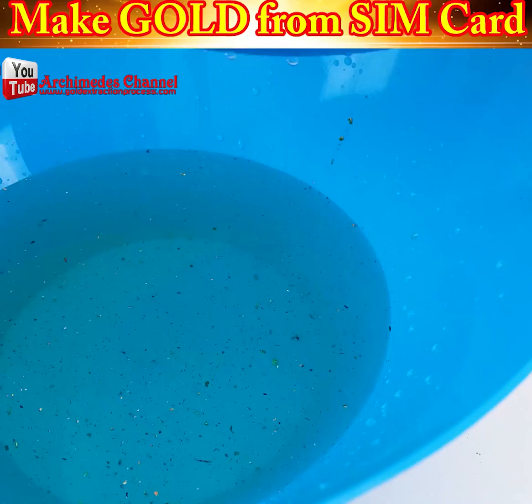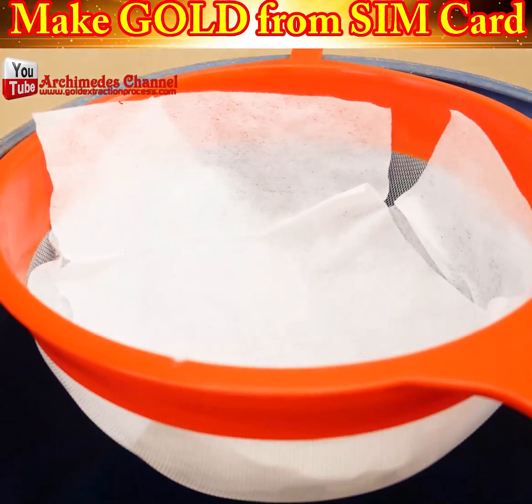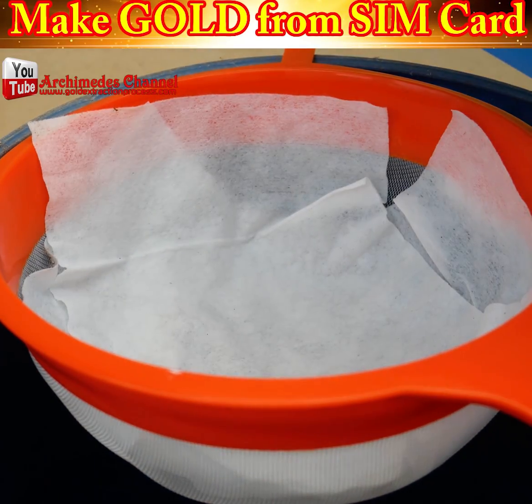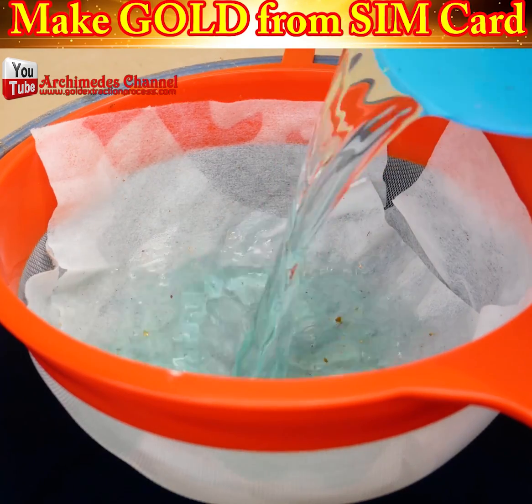You'll need a 68% nitric acid solution mixed one-to-one with water to separate the gold from the contact area of the SIM card. Then, to separate the gold sheet mixed with PVC SIM cards, you could use a colander and wash them with water.